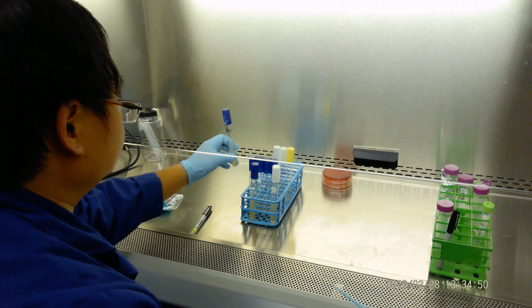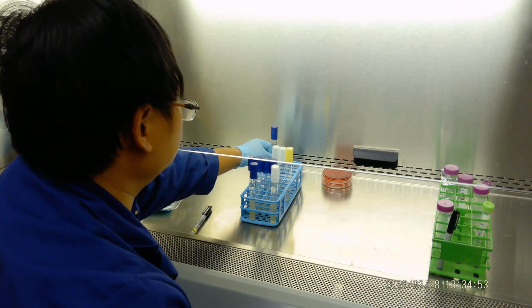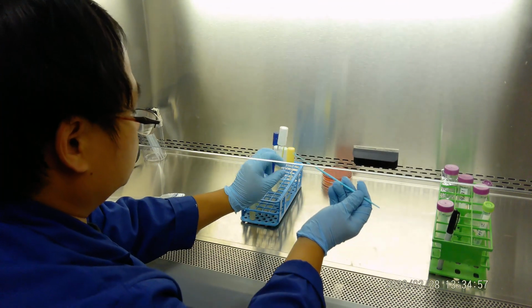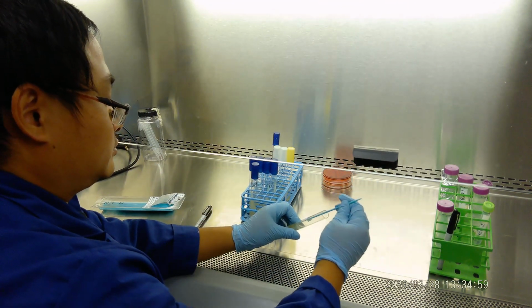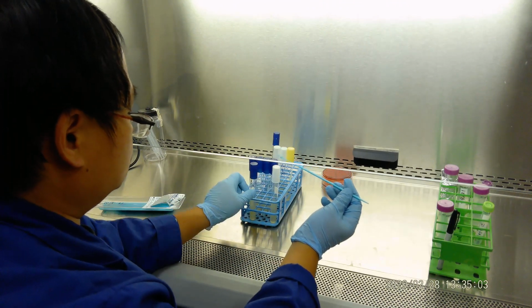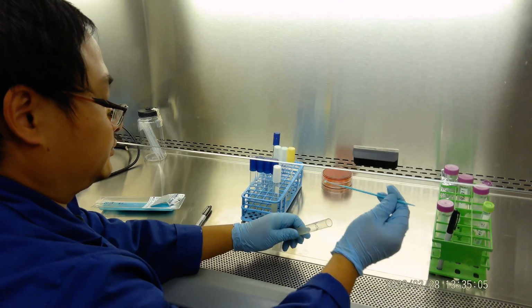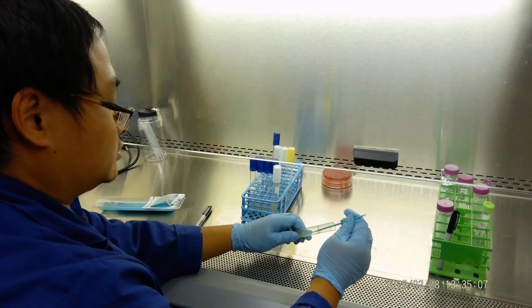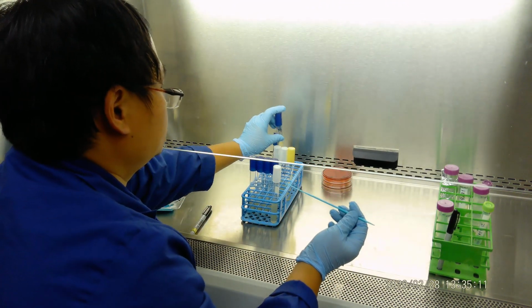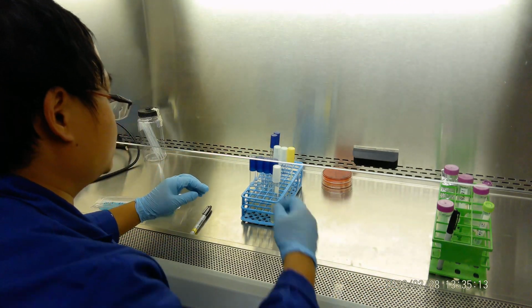Okay. This one finished, we put on the side. And the second one, we also do a Serratia zigzag streak. Okay. So this is the first job.